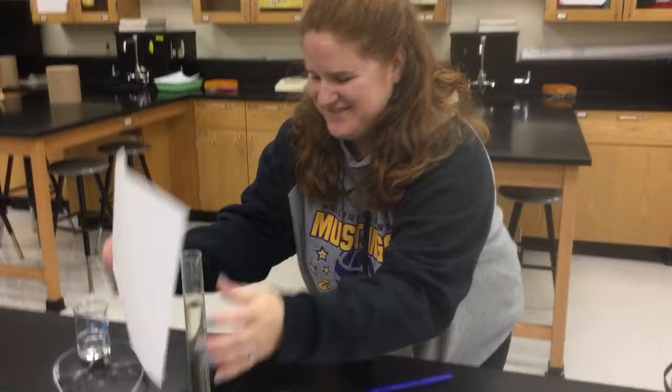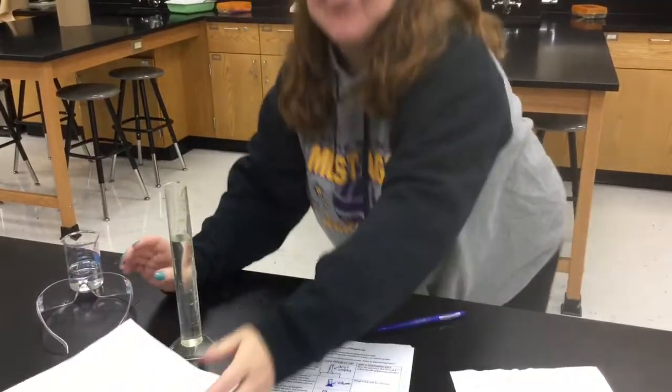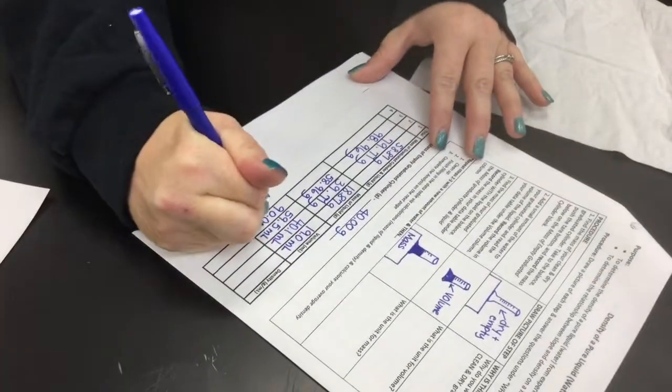She needs paper, which is okay. Using her resources. It's 90.0. Is it? Yeah! All right, so that's my volume, 90.0 milliliters. Okay, here's the big test.